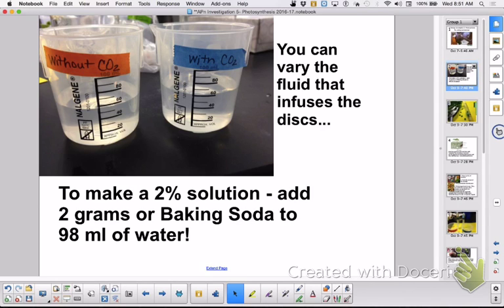And the water that you need to use is distilled water. And I have to make this water, so don't clean everything with this water. I have to do a little rain dance and then hold up some leaves and gather it.